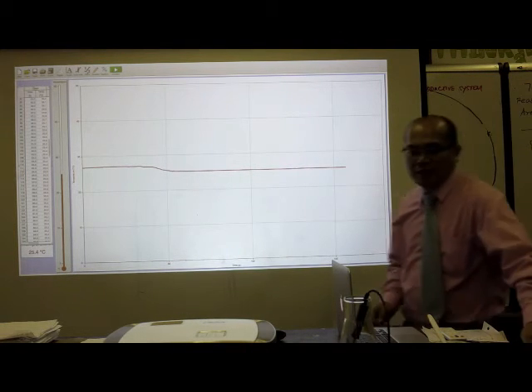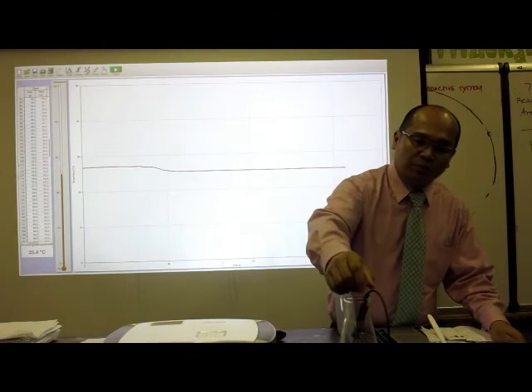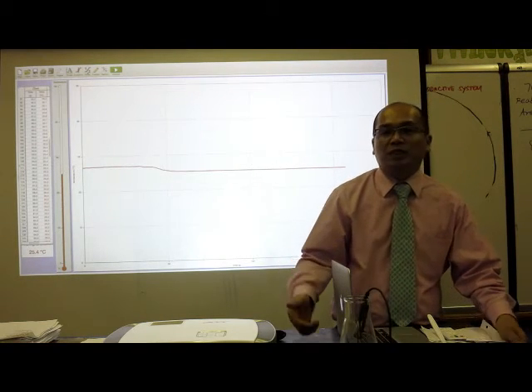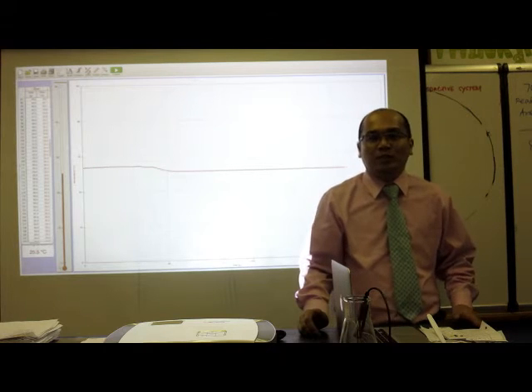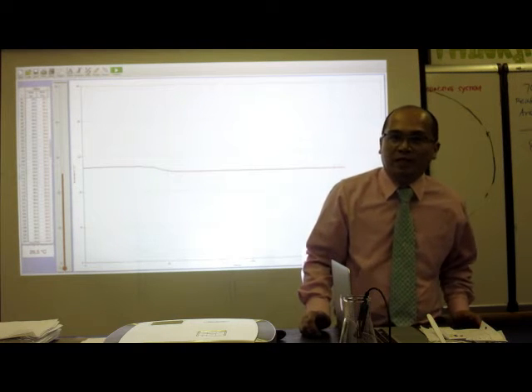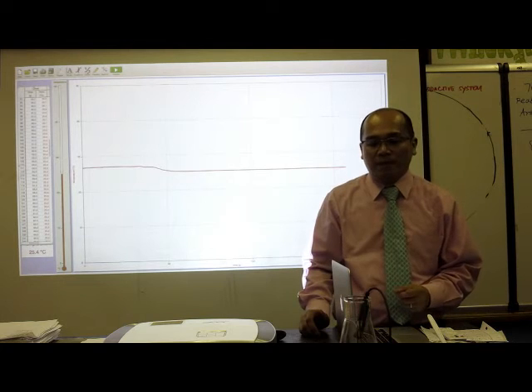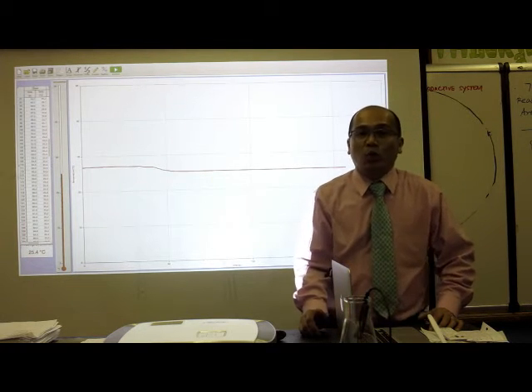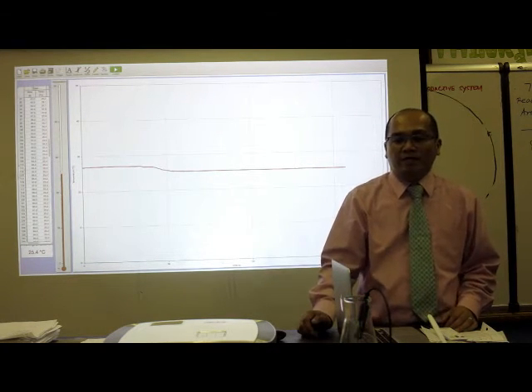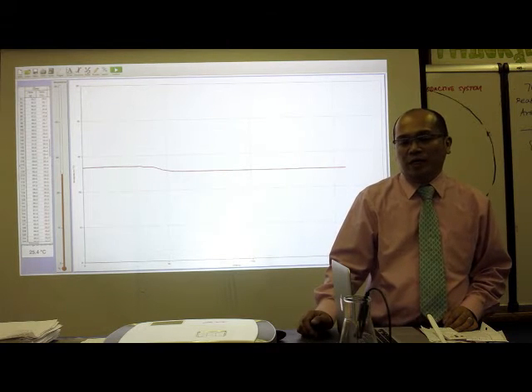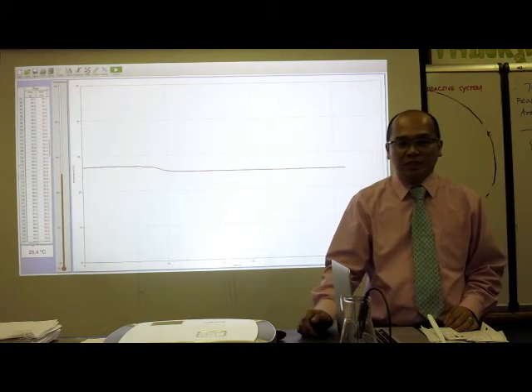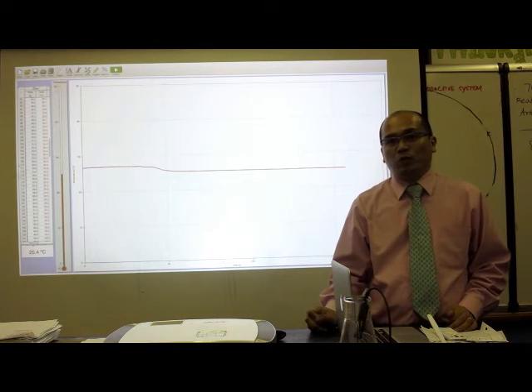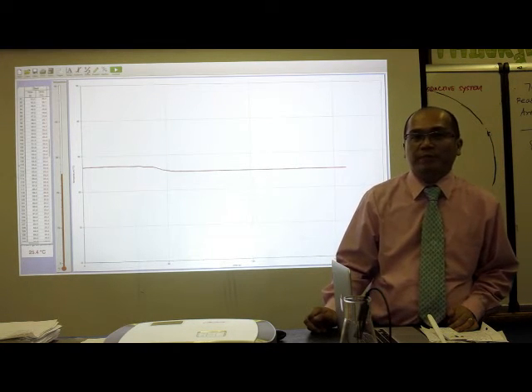Now, when I put the temperature probe on the vinegar, the initial temperature was 26.8. And after 20 seconds, I added baking soda. The temperature went up a little bit to 27. And eventually it went down, and after 300 seconds, the final temperature was 25.3.